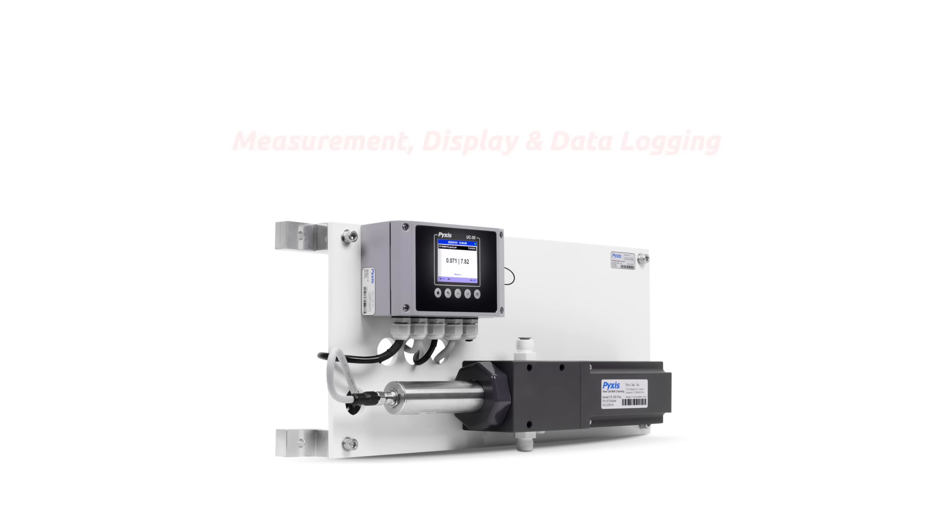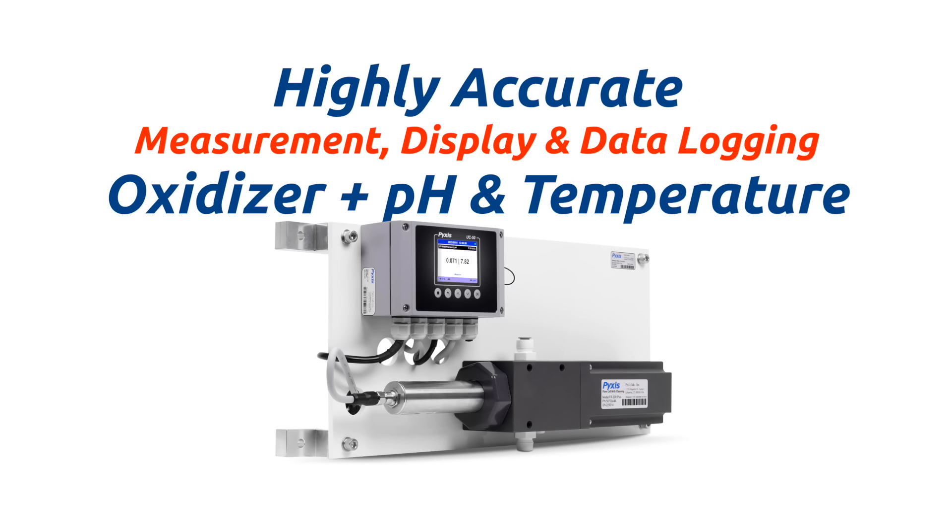The IK765B Series Analyzers offer highly accurate real-time measurement, display, and data logging of up to three oxidizer forms as well as pH and temperature, coupled with a Pixis UC50 micro display and data logging terminal.